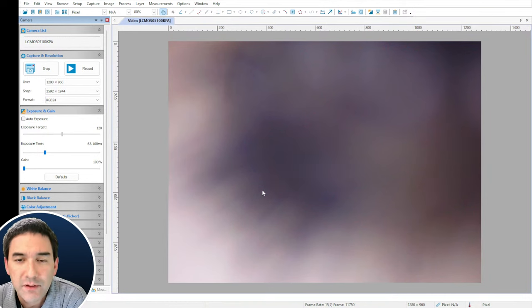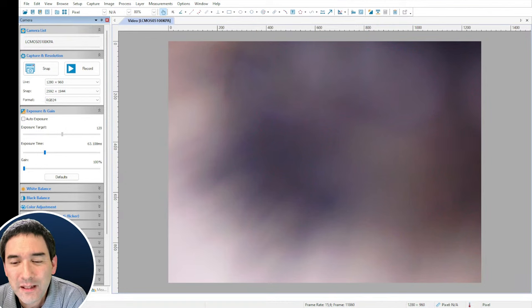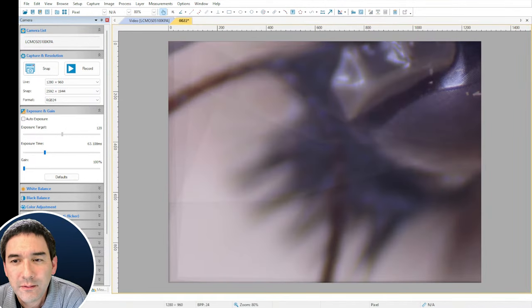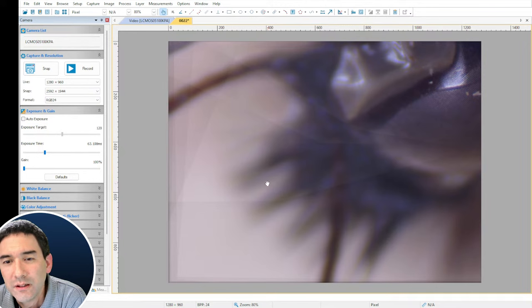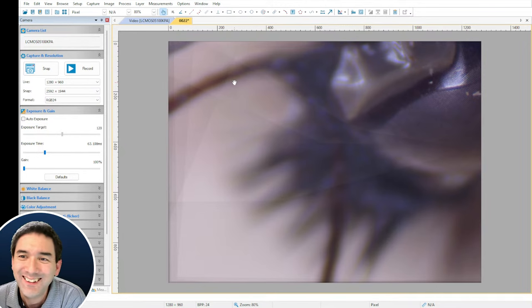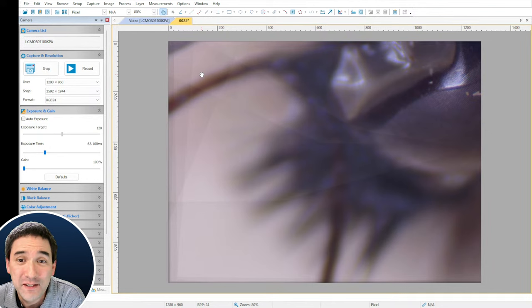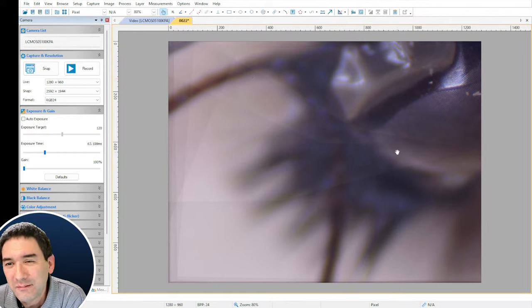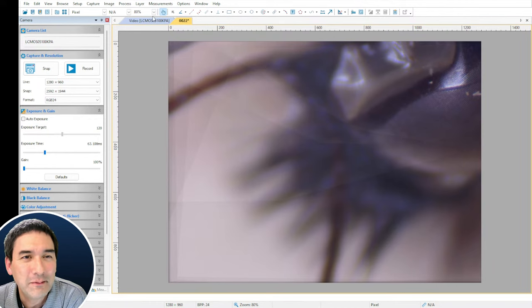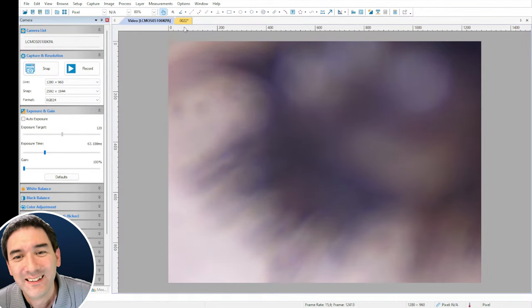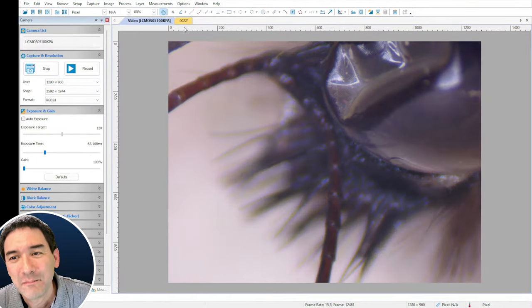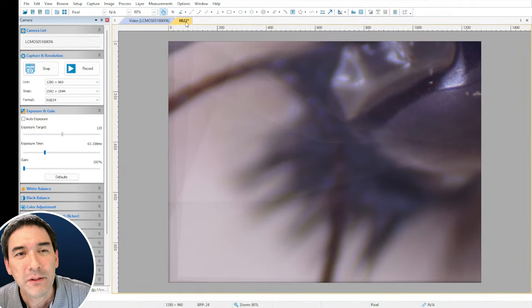Let's see if this works. The result — I'm not quite happy with it. Maybe I made the video a little too quickly. I just wanted to show you how this works, and you can of course try it yourself. I'm wondering if Helicon Focus allows importing videos — that would be interesting. Let's try File > Open Video and see if the video works better.